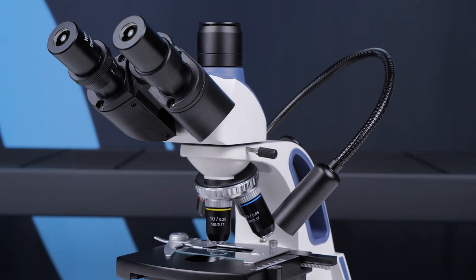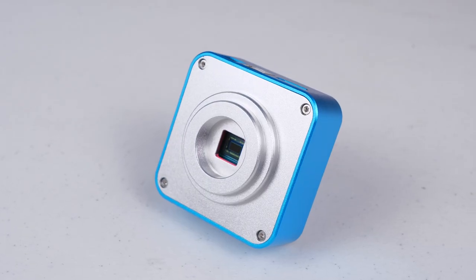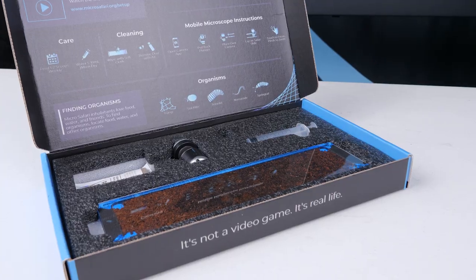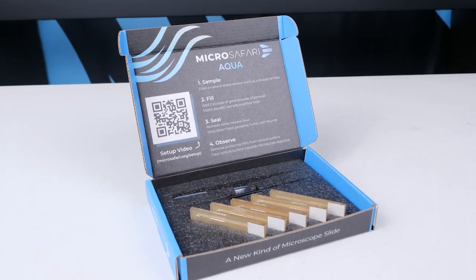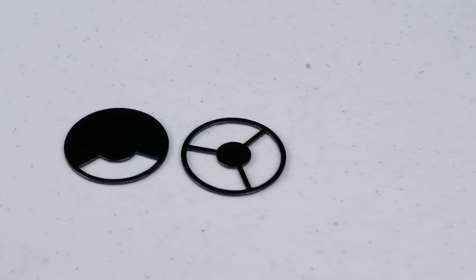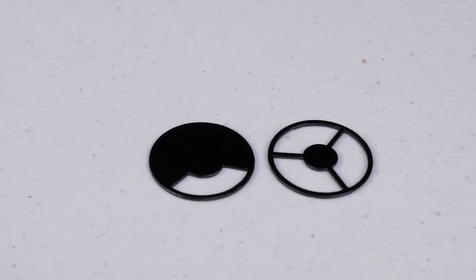Included in the kit, you'll find the Horizons Trinocular Microscope, the Horizons HDMI camera, MicroSafari Terra, MicroSafari Aqua, the reflected light illuminator, and a dark field and oblique illumination filter set.